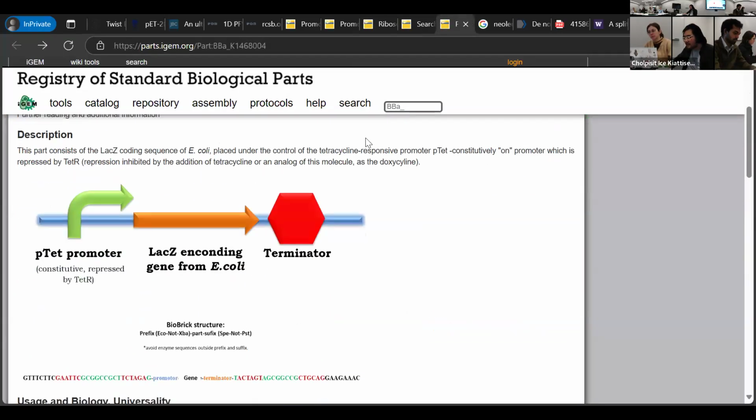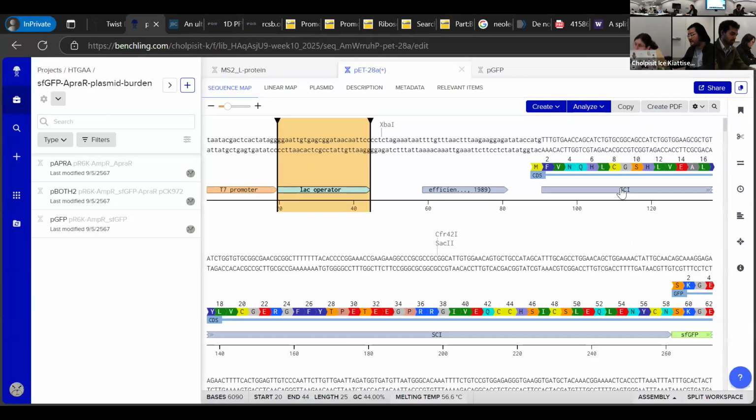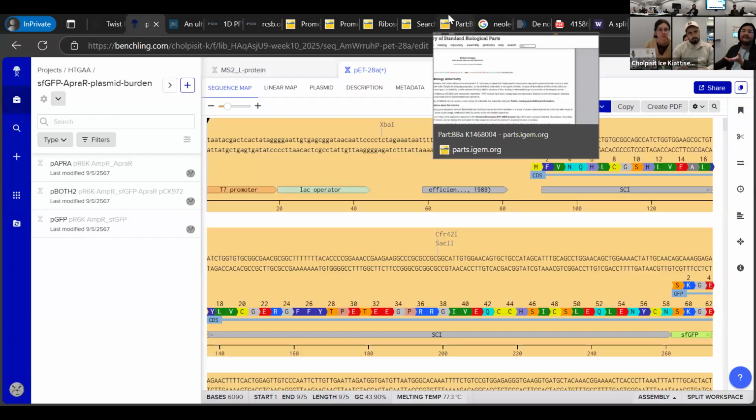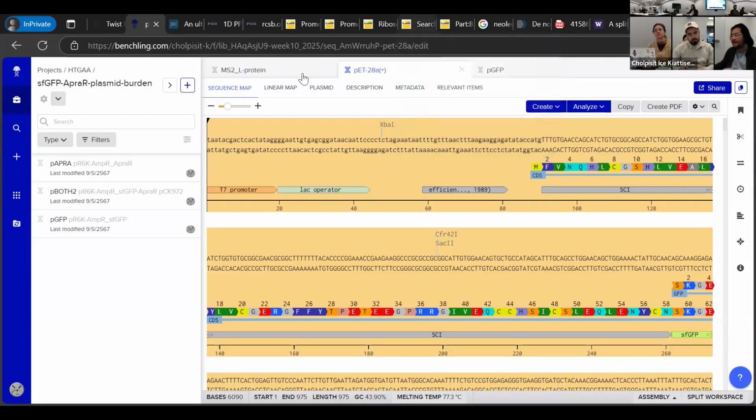There are also these inducible promoter parts. There are more than one. You can look into that. If you think of designing different RBS or promoters, you can include that in your DNA synthesis as well. So instead of ordering just this piece of coding sequence, you can include up to the upstream site and design your cloning differently. Or you can even tell Twist, if you're using something that they have to cut right there, to please put the designed sequence at that point, and they can do that for you.